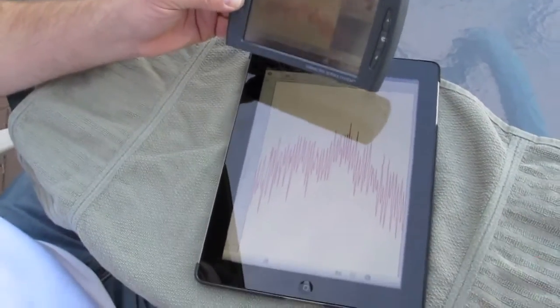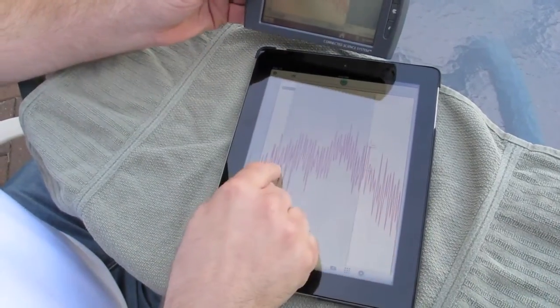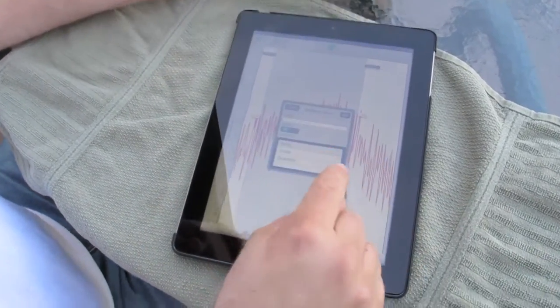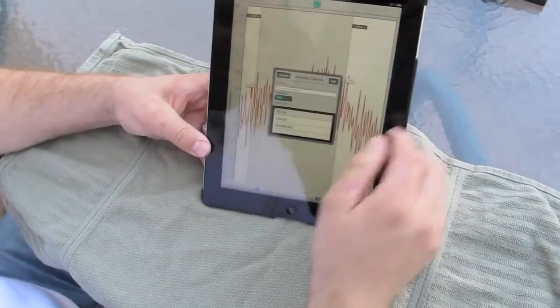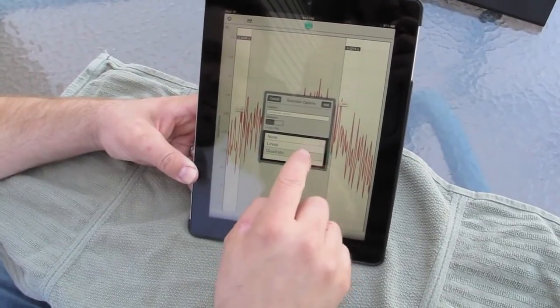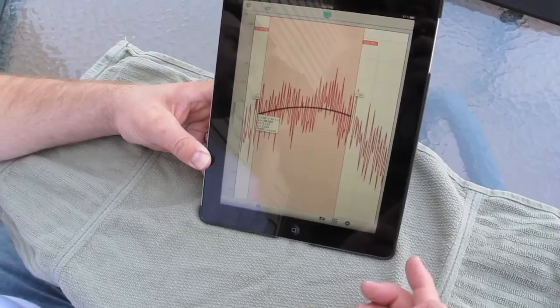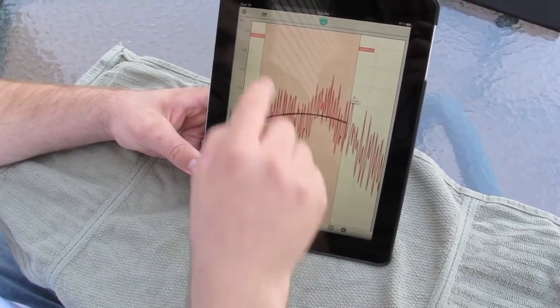This is nice, and I haven't explored too much with it, but you can do a bunch of other things. Now here, on the app itself, I can do some selection stuff. I can put a linear fit on it. I can do a quadratic fit. That's just in the browser? This is within the browser. That doesn't really make any sense, of course, but I'm just showing you what you can do. Well, I think there's meaning there.